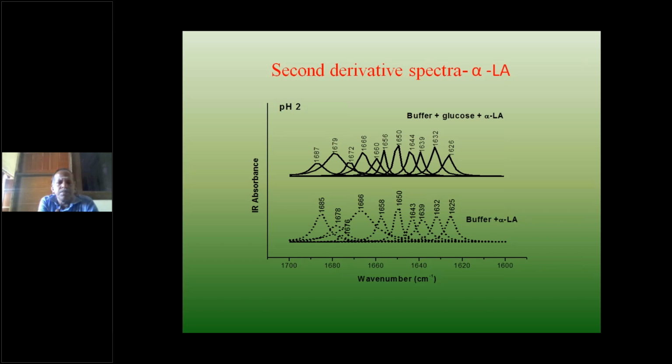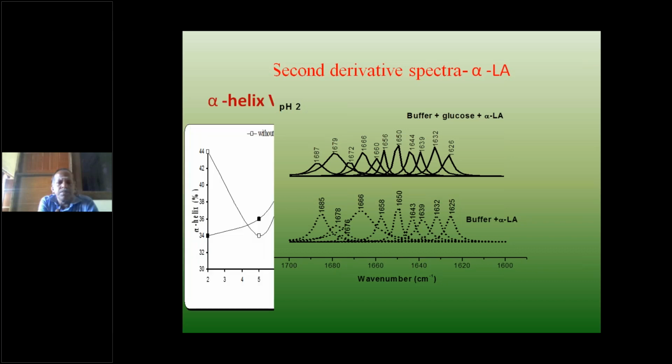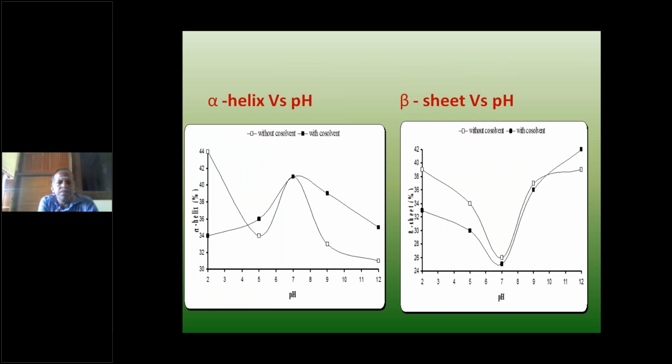It is called alpha-lactalbumin. So these ultrasonic and FTIR studies both confirm that the addition of sugar is increasing the structural stability, whereas the other one is deteriorating the structure. So that's the conclusion we have obtained by the addition of sugar component. Sugar refers to glucose as well as fructose.